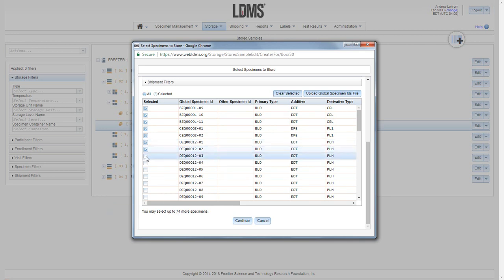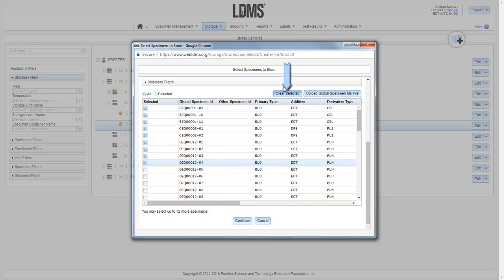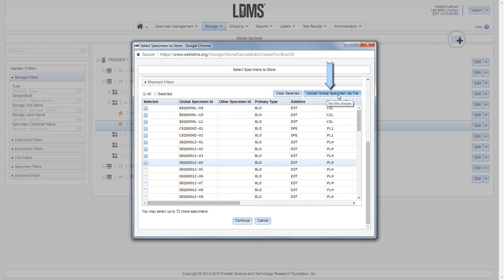These will remain selected until you either clear them or deselect the checkbox, allowing you to apply different filters and select further specimens. Also note you can simply upload a file of global specimen IDs to fill this list.